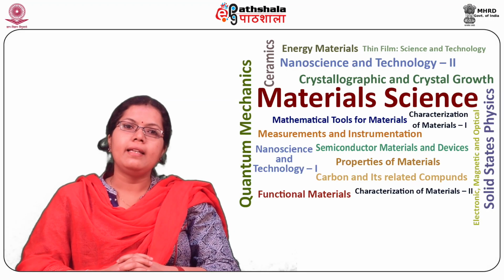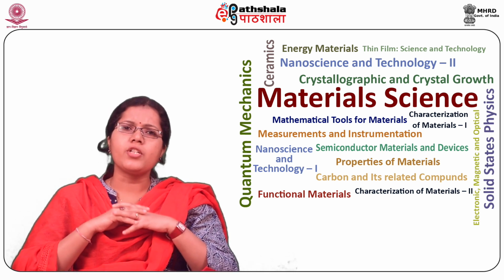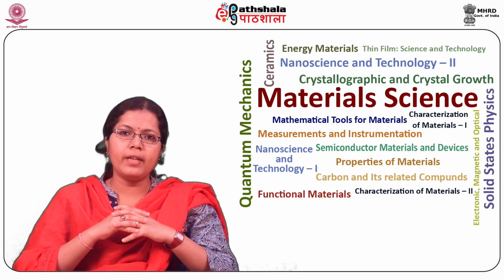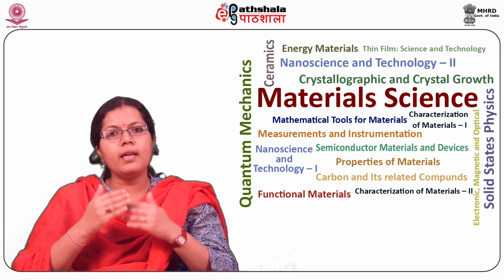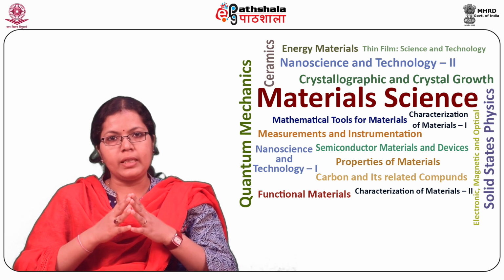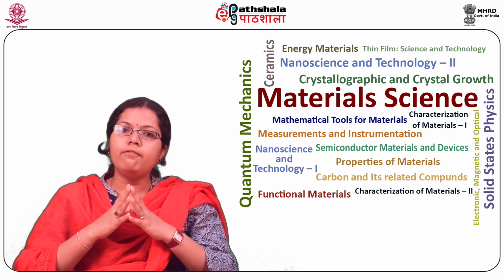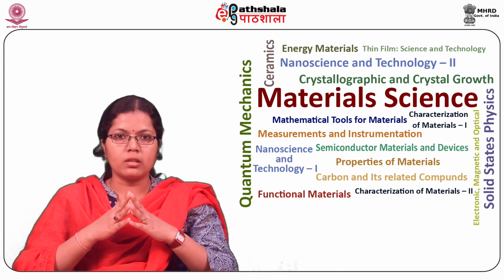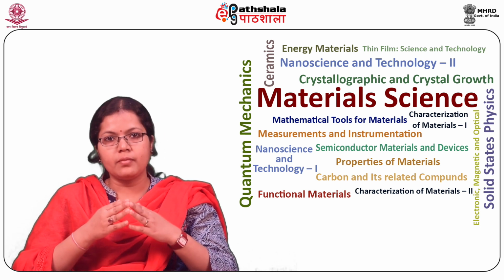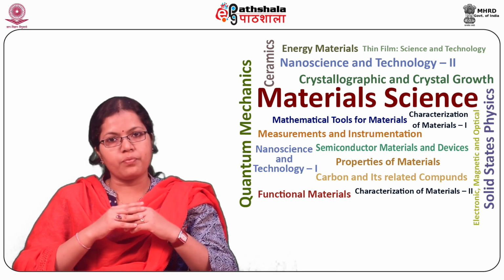Now students, let us consider the field emission gun. Field emission refers to the emission of electrons that are stripped from the parent atoms by a high electric field, typically 10 raised to 9 volt per meter. The field emitter is a single oriented crystal of tungsten, electrolytically etched to a fine tip, with the tip diameter of 100 to 1000 angstroms.